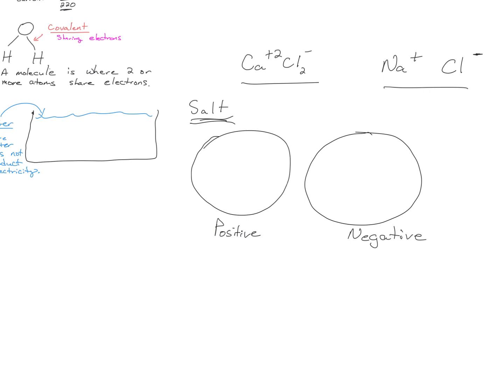Can you undo a covalent bond? Oh. Yes, you're about to undo it. You're literally, this is what we're doing. This is electrolysis. Yeah, he's right. Pay attention. So sodium chloride, they stick together.